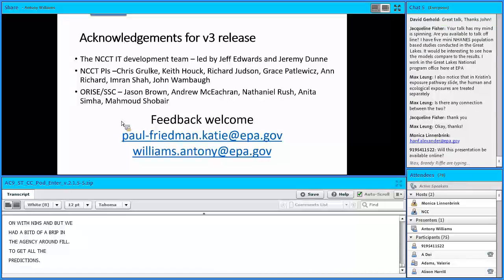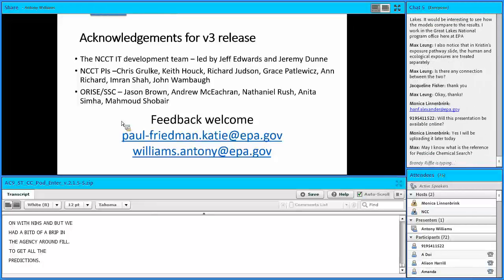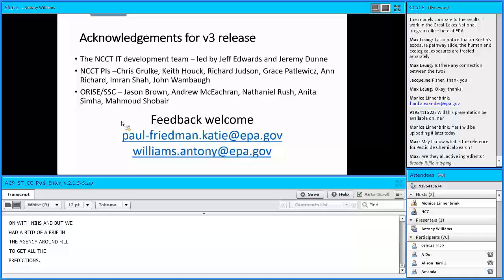Any estimate when the CSMID predictions might be publicly available, searchable, and all that? So, as you know, you can use them today. That interface is available to you today internally. Yeah. It is really about priorities that are set now for the next release. And to make it public, I don't think would be too much work, but on the list of priorities, it's lower than some of our functions right now.